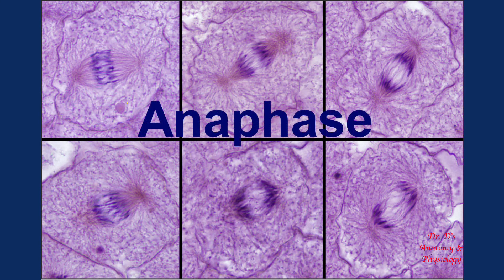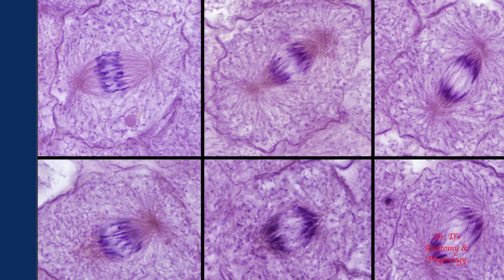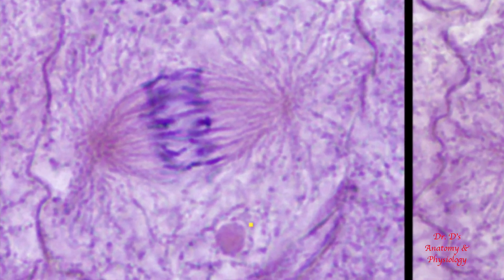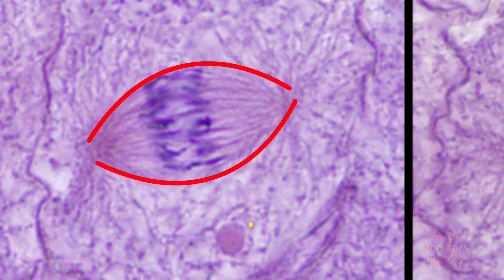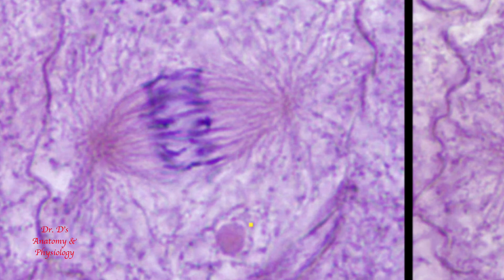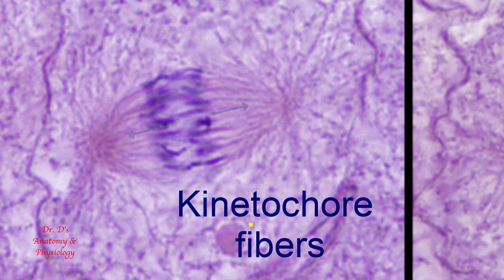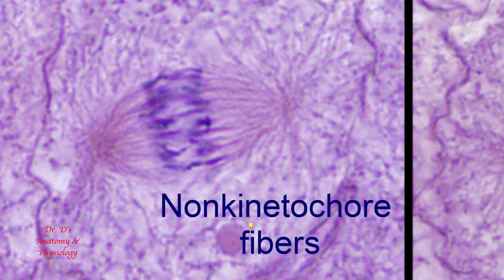The next phase is anaphase. The prefix 'ana' means apart, as in anatomy, which means to cut apart. During this phase, the chromatids separate and move to opposite poles. When the chromatids separate, they are now called chromosomes. Here is an early stage of this separation — notice that there is now a space between the duplicated sets of chromosomes. The spindle apparatus now has a definite spindle shape, like an American football. Within this spindle there are kinetochore microtubules, which are pulling the chromosomes of each duplicated set to either pole. There are also non-kinetochore microtubules, which go past the chromosomes and interact with fibers from the other side in a manner that pushes the chromosomes apart.